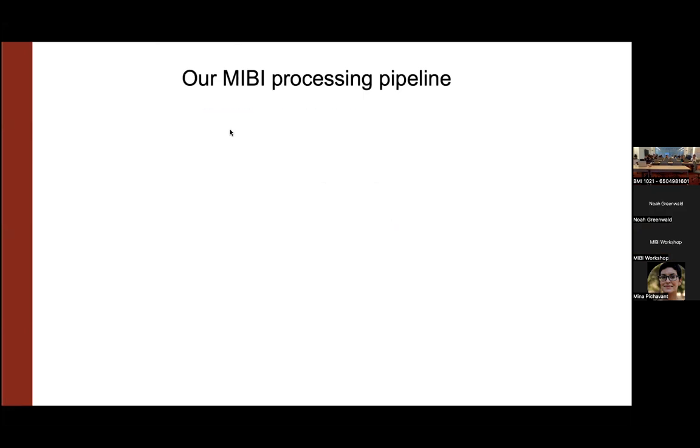Okay, so this session is very MIBI specific. All the other parts of the workshop that we covered so far, and the ones in subsequent sessions, will be more generally about multiplex imaging analysis. This one is highly tailored to the initial low-level processing of MIBI data. Everything that we're going to talk about in this session is publicly available as part of the Toffee GitHub.